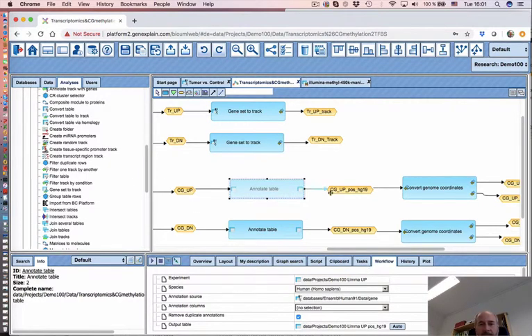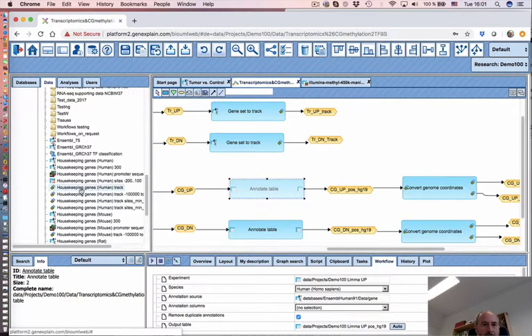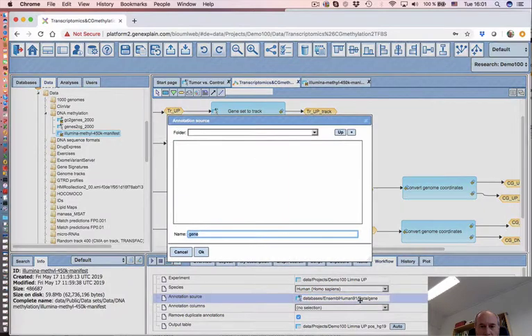As we know, it is in this table which is already prepared in the public repository. So here we had a look. We have to add this table to this folder. We need simply to add the URL of that table here into this folder.